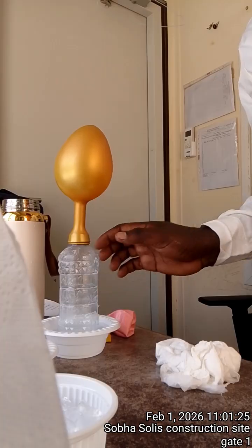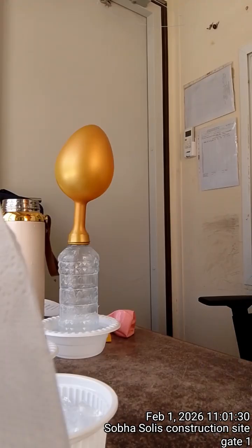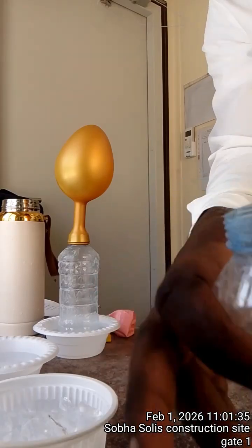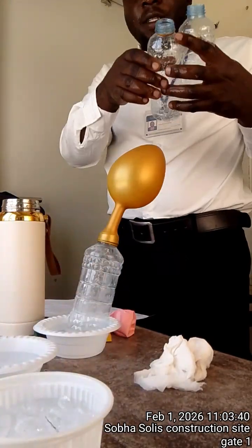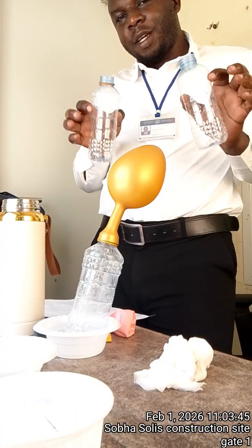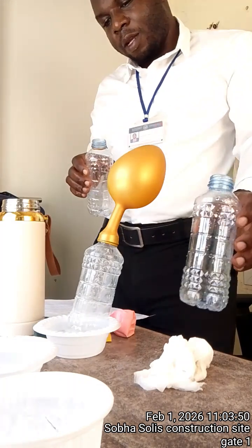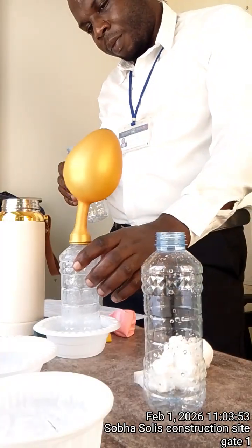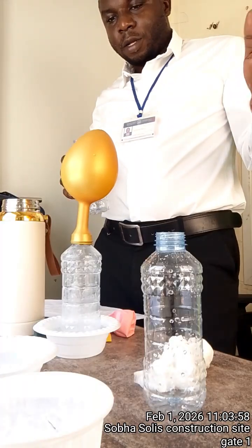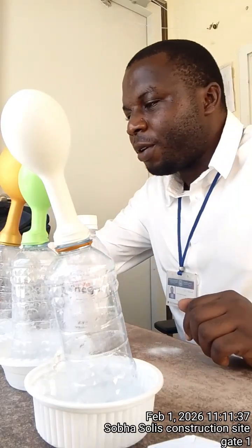Have our first one immersed in warm water, and we are giving it some time. So members, the first experiment was shut down because of the spillages, so I'm back with these two again. This one in warm water. I think the reaction has stopped. We shall discuss the details of this.